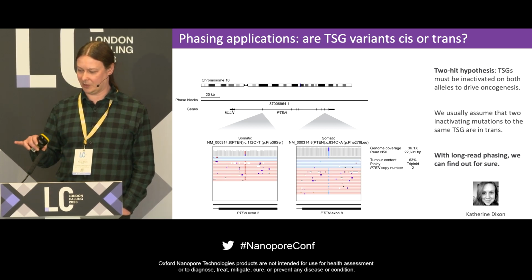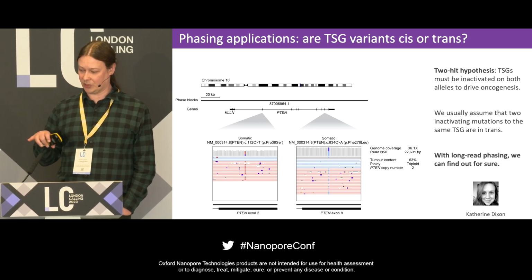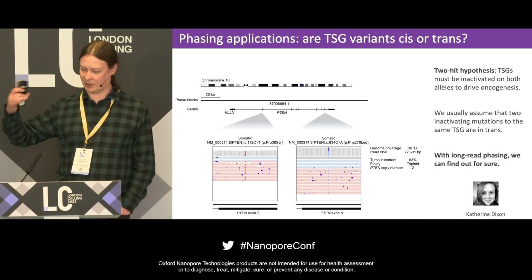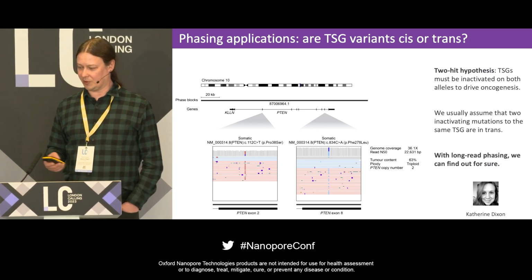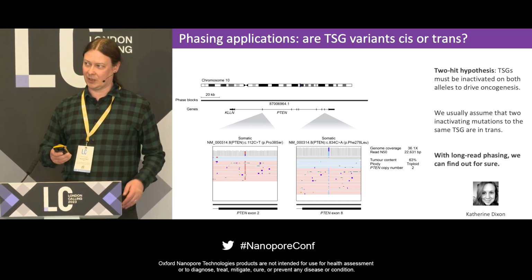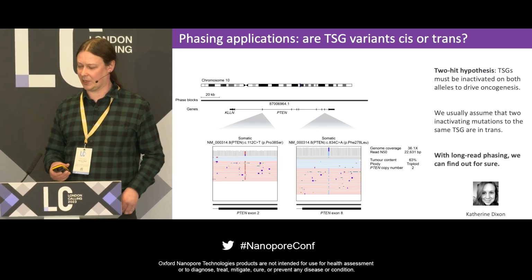In fact, this image shows a case where the two short variants were actually in cis to each other. This tumor suppressor was knocked out on the other allele, but by loss of heterozygosity, which you can see with the blue reads on the other haplotype being lower copy number. That was a case where we would have assumed that it was due to the small variants and not from the copy number. And it means that if we do have a case where a tumor suppressor hasn't been knocked out, with both small variants in cis, we can actually detect that.